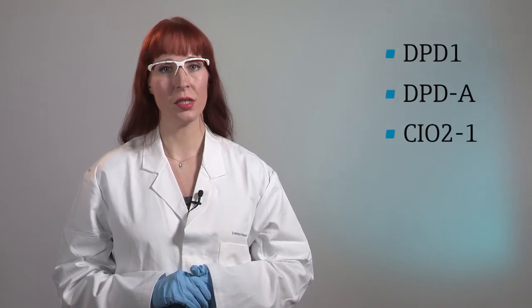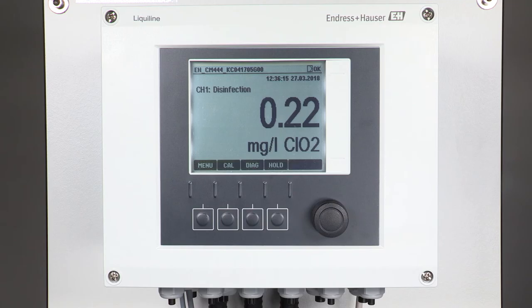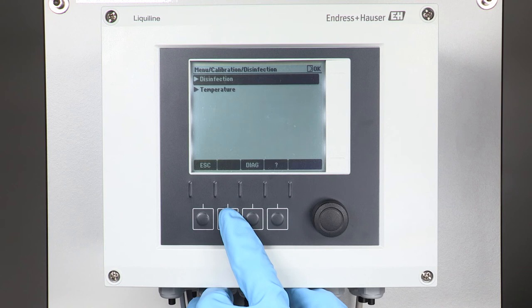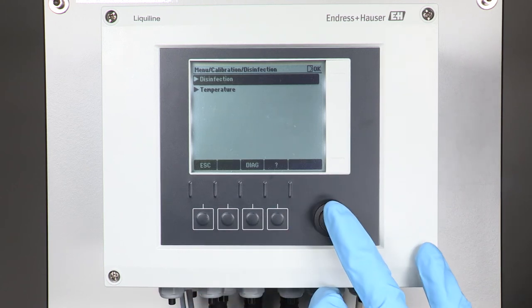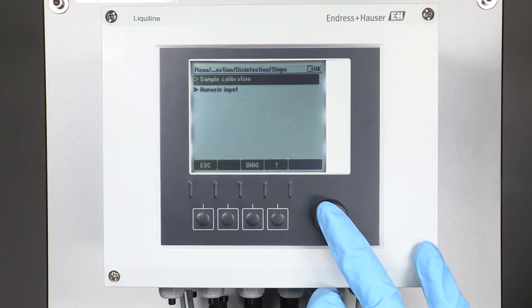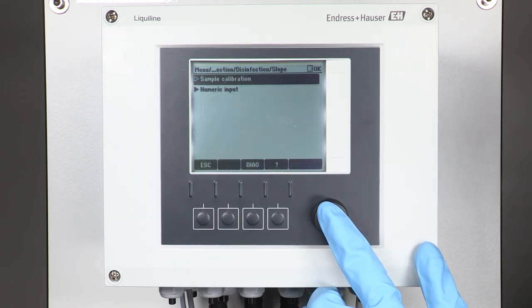Now we start with the calibration procedure. For the determination of Chlorine Dioxide we use a dedicated reagent. Depending on the manufacturer this may be called DPD1 or DPDA for example. First we start the calibration procedure at the liquid line transmitter. Therefore we press calibration, choose disinfection, then slope and come to sample calibration.